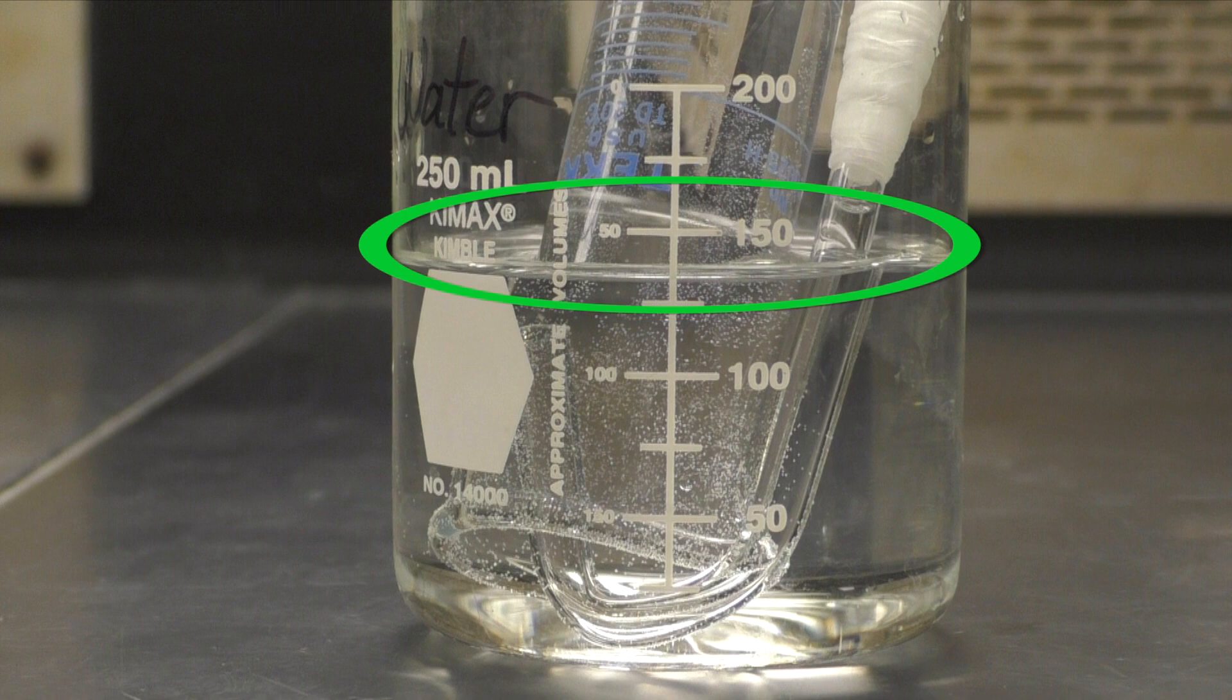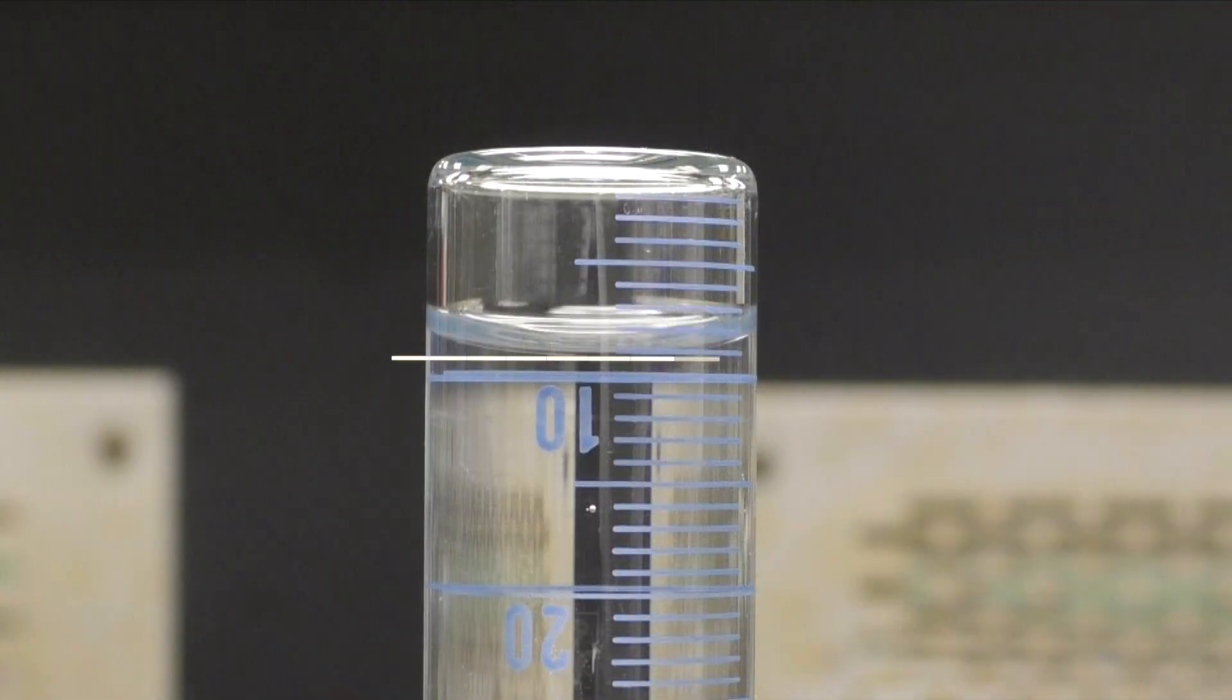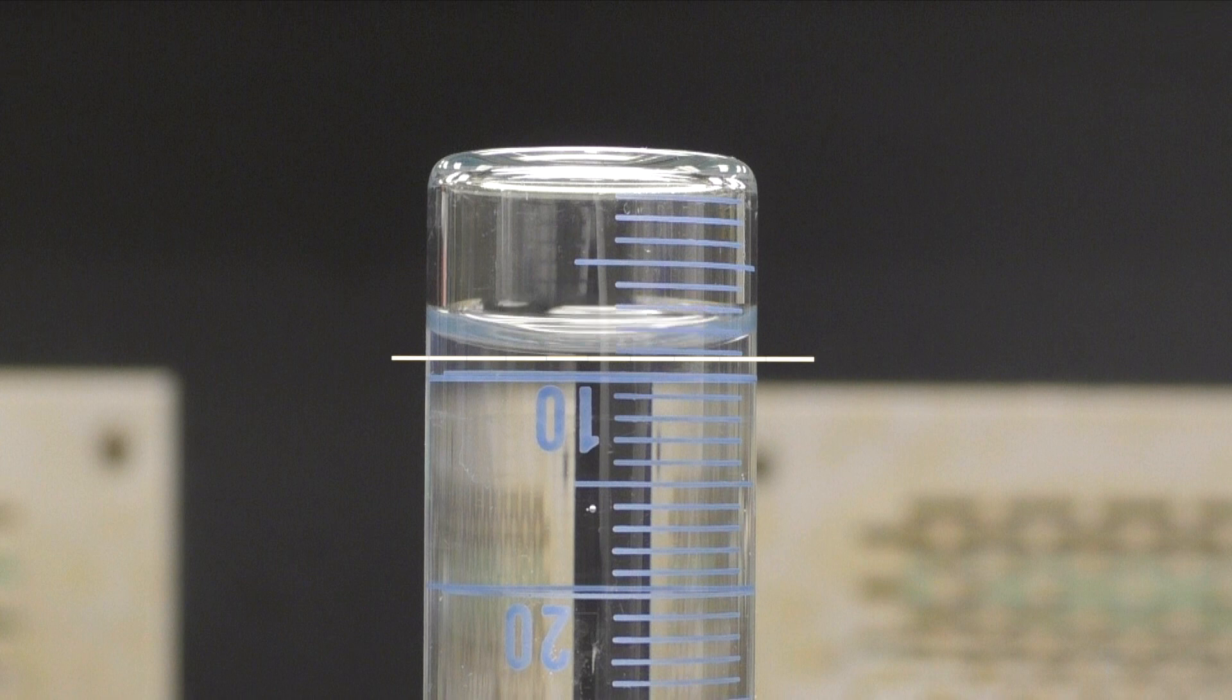Once the water in the beaker has been drained to the proper level, take an initial volume reading in the graduated cylinder. Remember, you are measuring the volume of gas in the cylinder, not water. So in my example, I have about 9ml of air to start with.